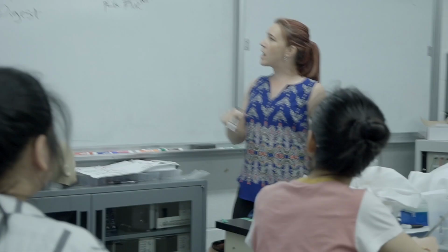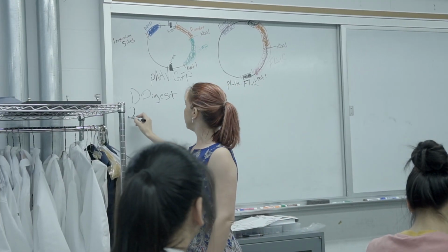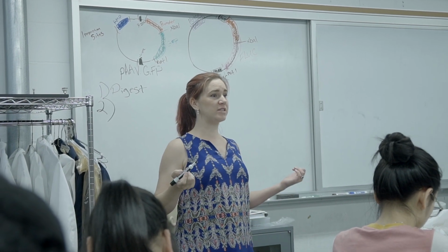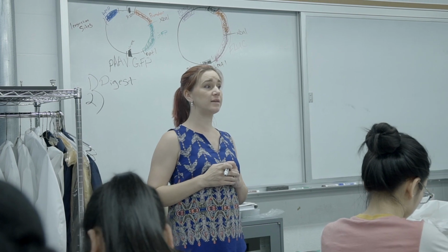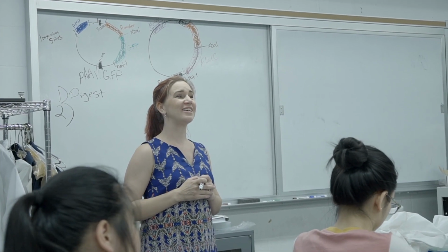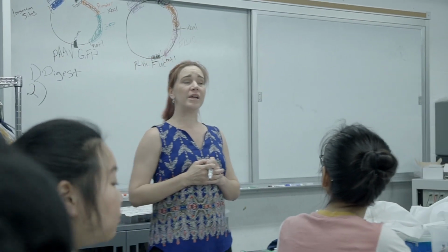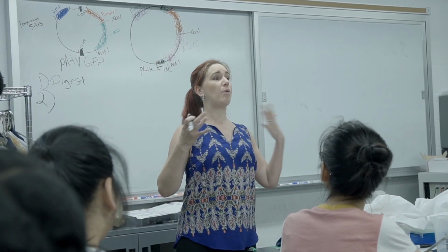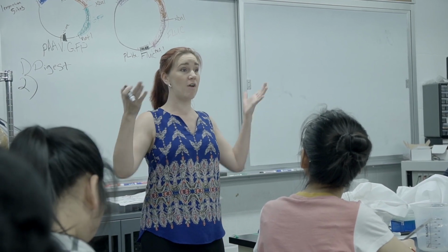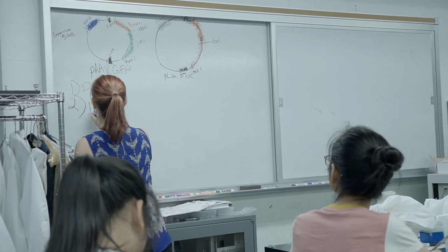And then what am I going to do once I run that digestion? We're doing it right now. What am I going to do with that once I've digested these with my restriction enzymes? What's happening right now while I'm talking to you? Yes? I will make sure they don't re-stick, but what experiment am I going to do? And I heard someone say run a gel, right? I'm going to run it on a gel. So we're doing that right now. So I'm going to run these on a gel.